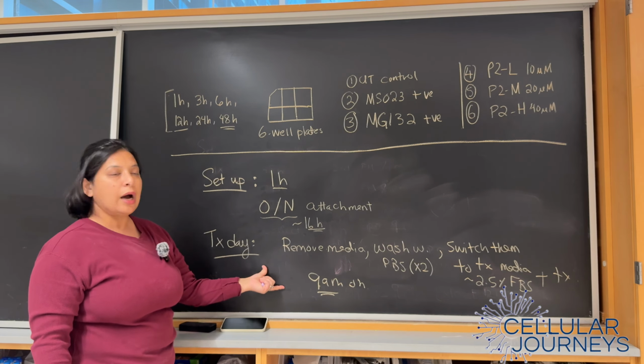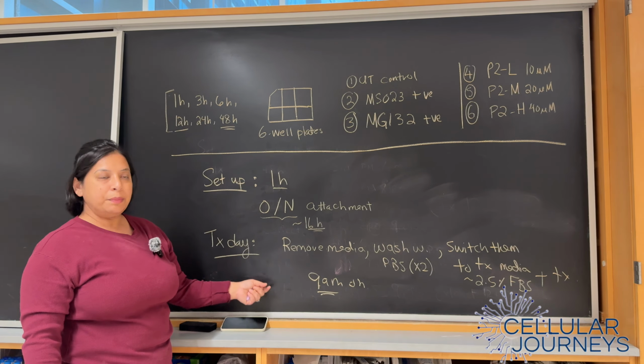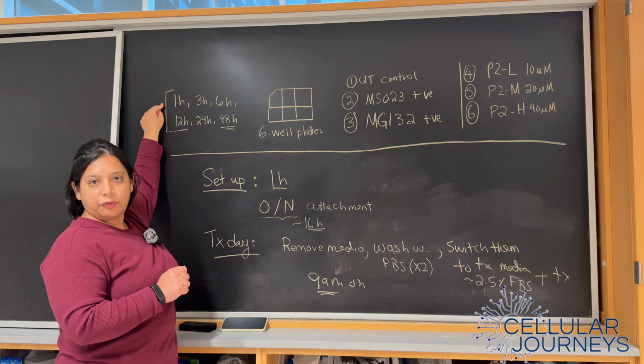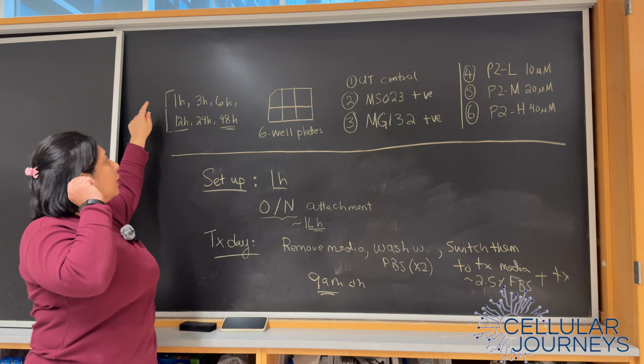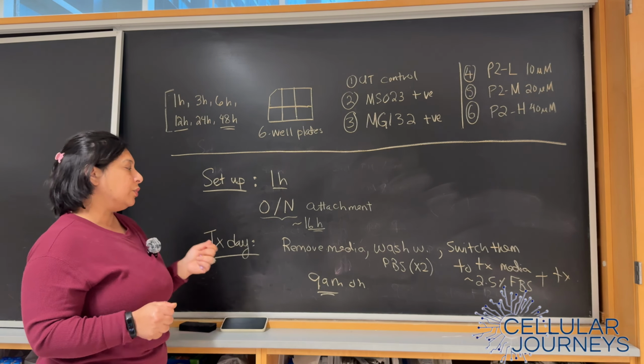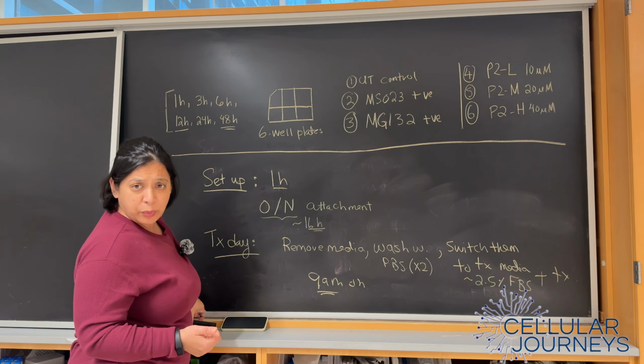If you start the treatments all at the same time, that itself is going to take you the longest. So let's say about an hour to 2. But once that's set up, each time point should only take you about 15 minutes to extract and get back in the freezer. It's not going to take you very long. But you do have to be there exactly at that time to be ready to extract. So that's one way to do it.